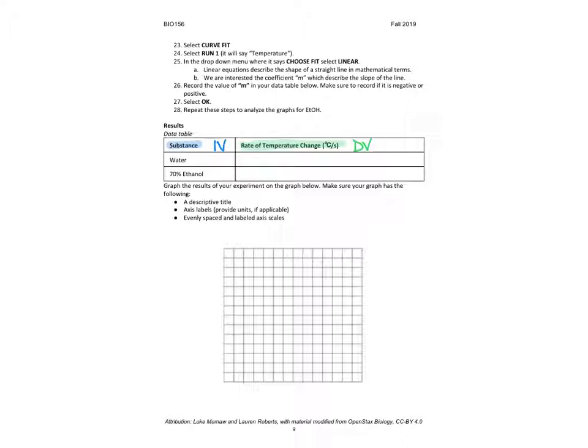All right, so you should have a number in here that is similar to what you had in the first part, where you have a negative 0 point and then some number. I'm just going to make up numbers once again. Actually, I'll use the same numbers I used in the first part. So this is the data that you are graphing, and it goes on the graph down here. You got this data here, the M value that you got from the LabQuest unit.